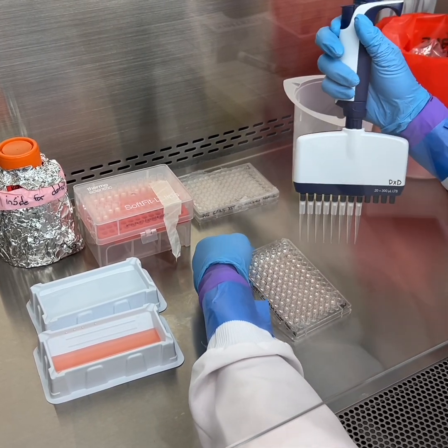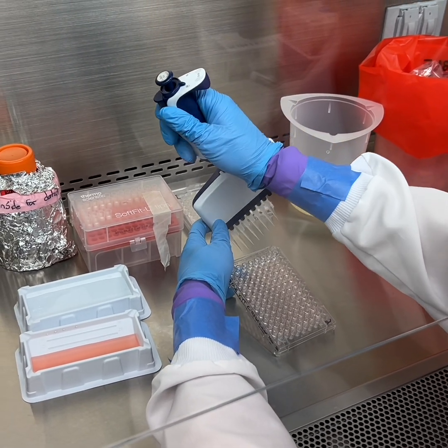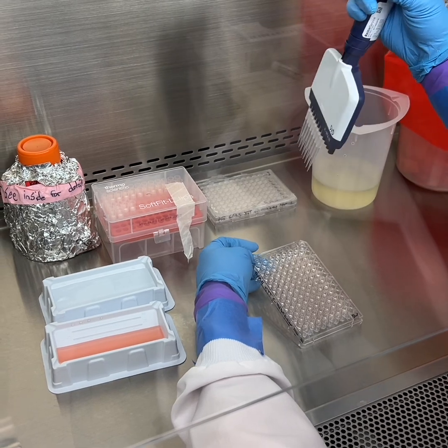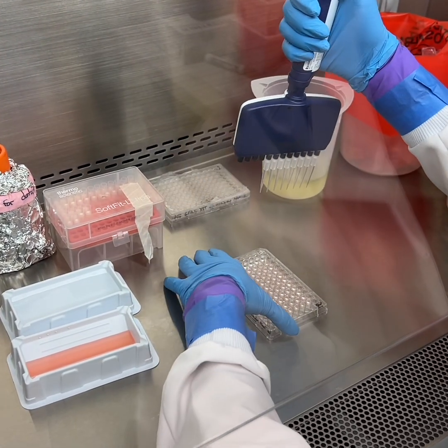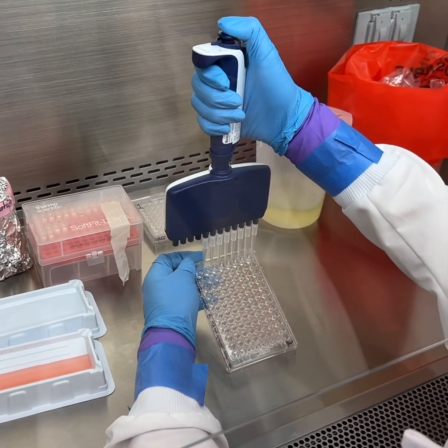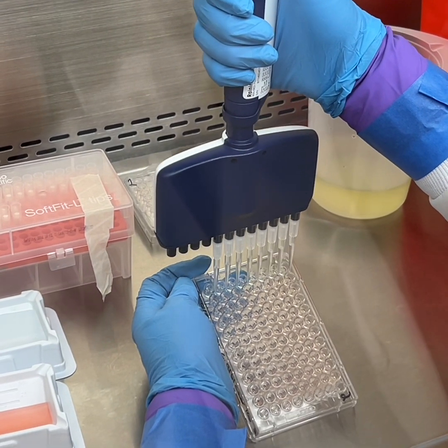So I'm actually going to go like this. Let me get a better grip on that. There we go. Okay. So this has already been mixed. So just grab 100.